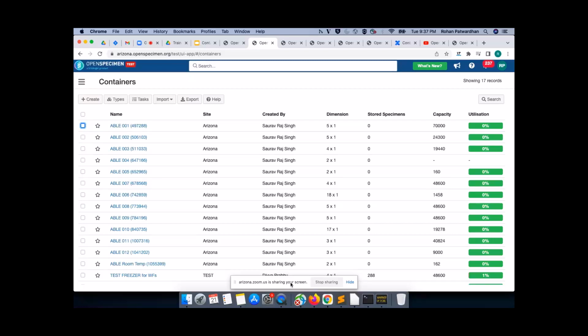Okay, and to create new boxes or new drawers and the overall container structure, who does that? Is it the end users or the administrators? The administrators. Okay, so administrators will have access for everything. Yeah, and I actually did have a question related to this.